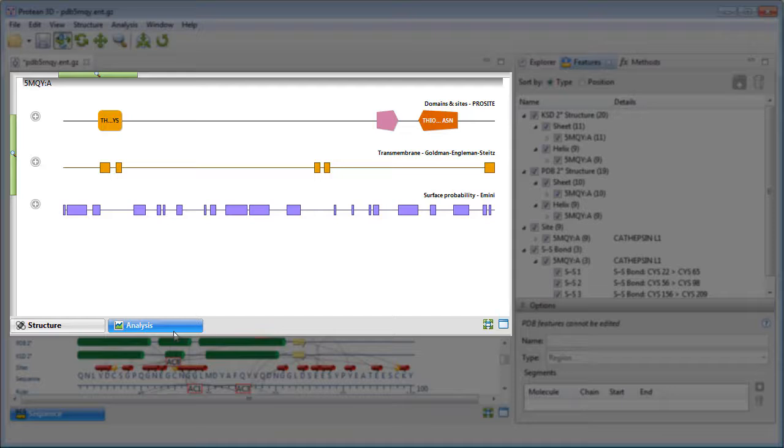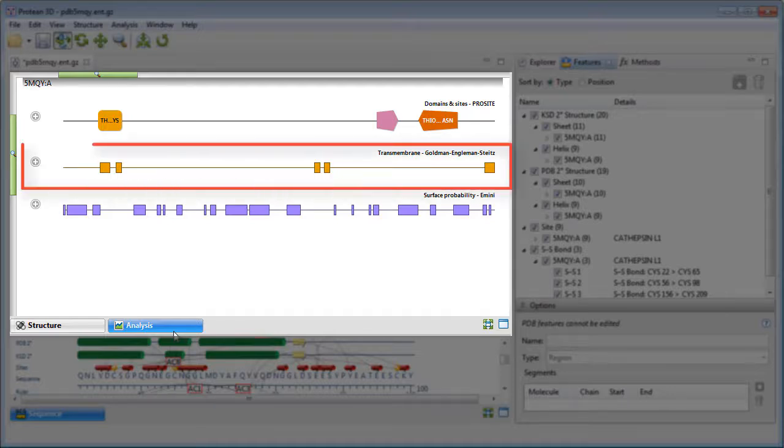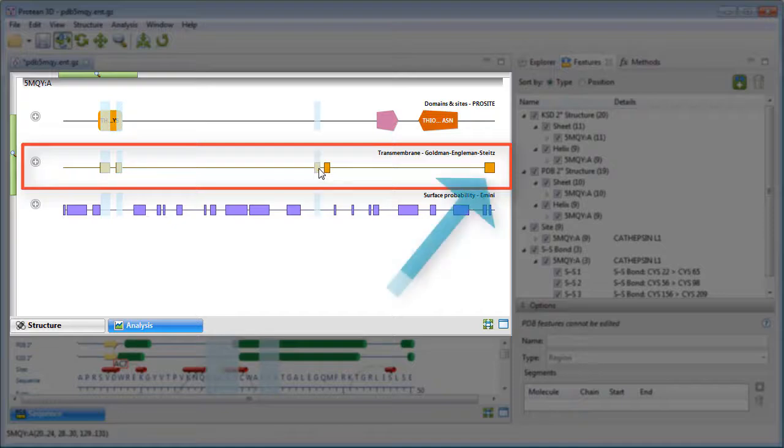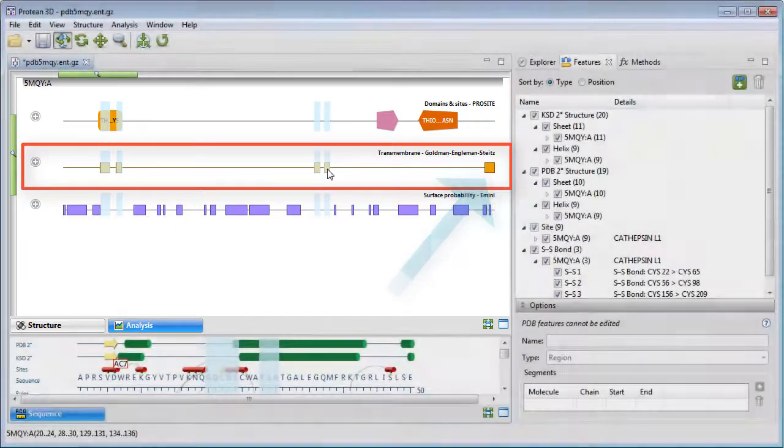I want to create a new feature based on predicted transmembrane regions, so I'll press the Control or Command key while selecting the segments. For now, I'm going to leave out the rightmost segment.